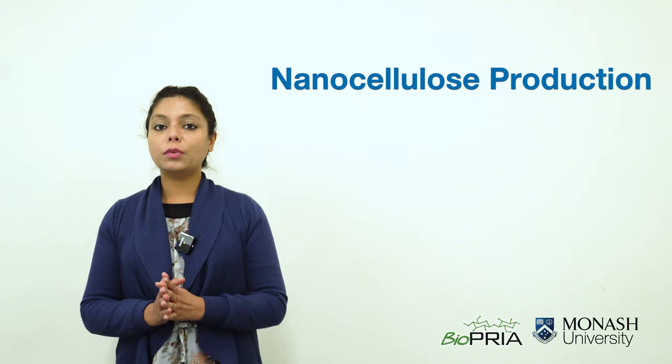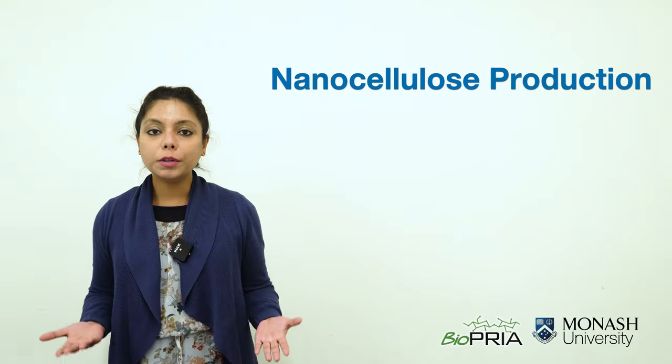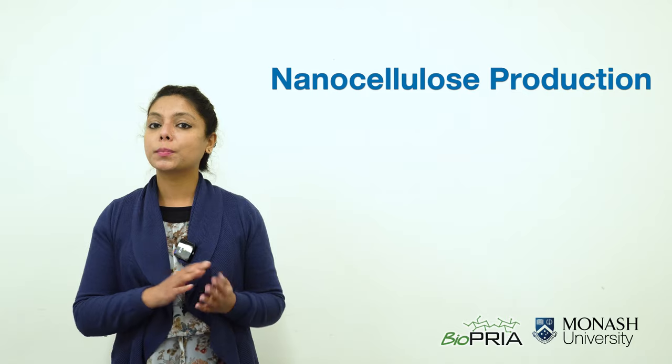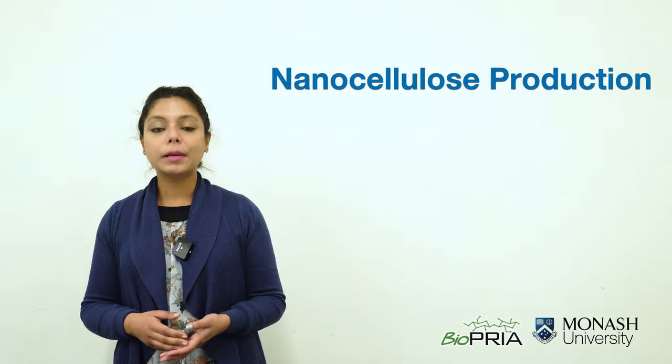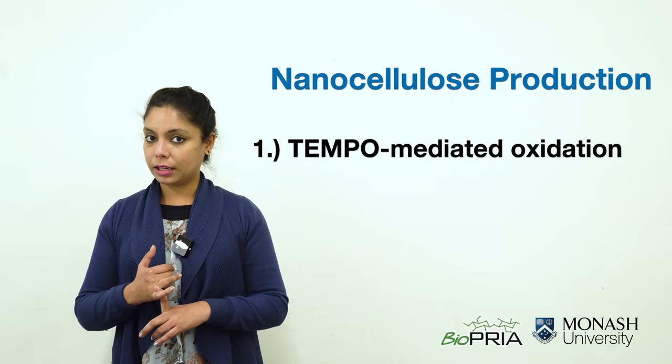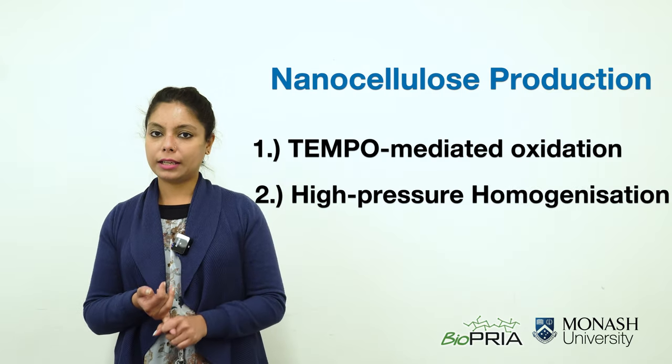In this video we are going to show you how we produce nanocellulose fiber from cellulose pulp. We produce nanocellulose fiber from cellulose pulp in two steps: first TEMPO oxidation and second homogenization.